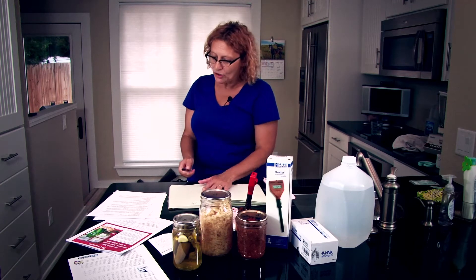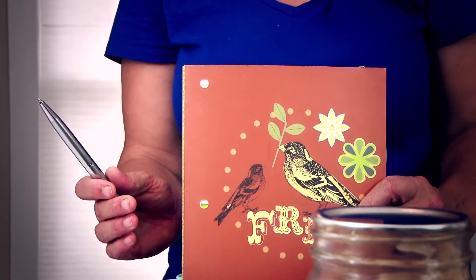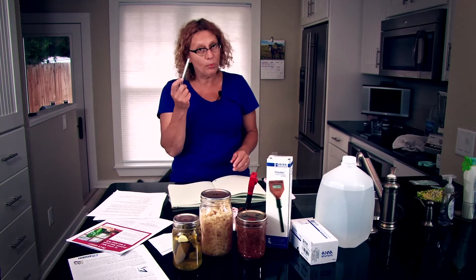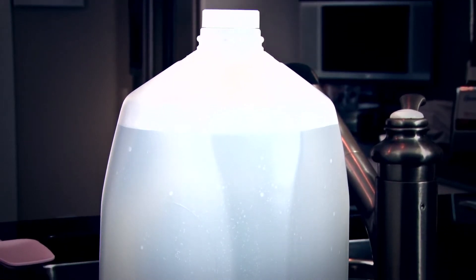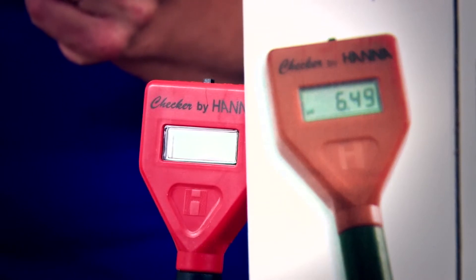What you'll need is your recipes. When the State Department sends an inspector to a farmers market, you will be asked to produce not only the record of when and what your pH level was in your particular product, but you will also have to show them your recipe so they can check to make sure it is a safe recipe. In addition to your recipes, you're going to need a notebook in which to record your pH levels and the date that you take the tests, and you should bring that with you always to the farmers market. You'll need a notebook and a pencil, of course. You'll also need some distilled water in which to make a slurry. You'll need your pH meter, which can be purchased from Hanna Instruments — that information can be found at the end of this video.